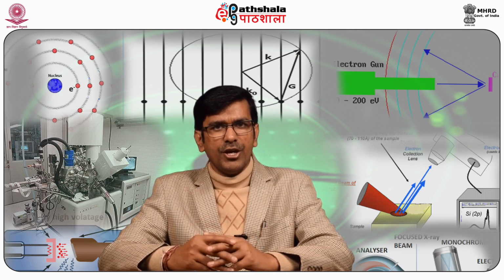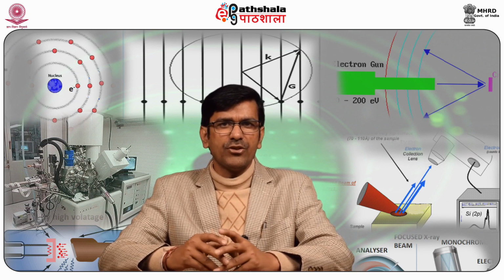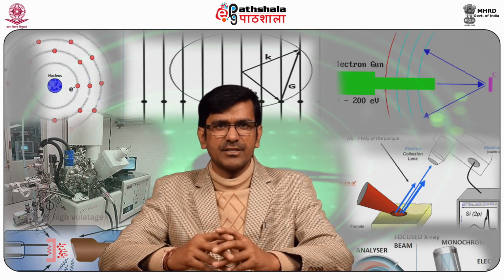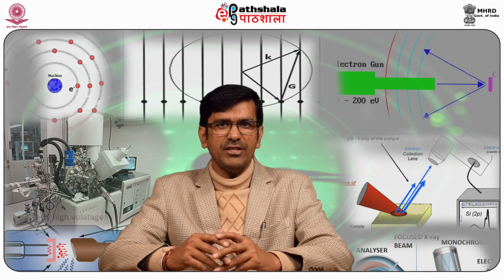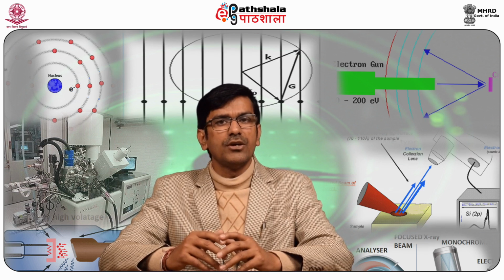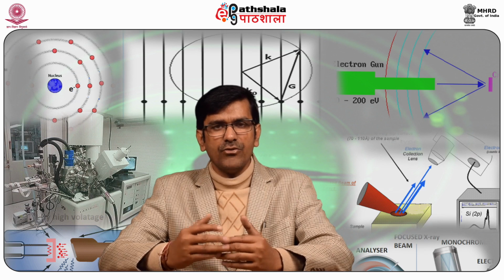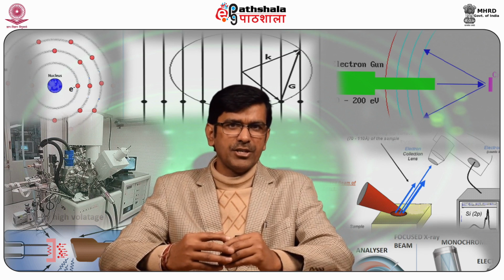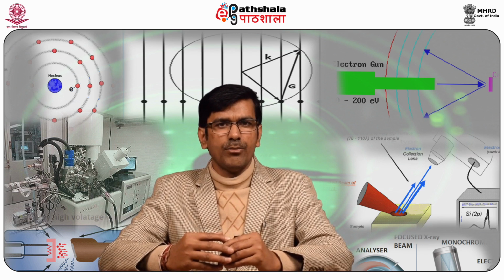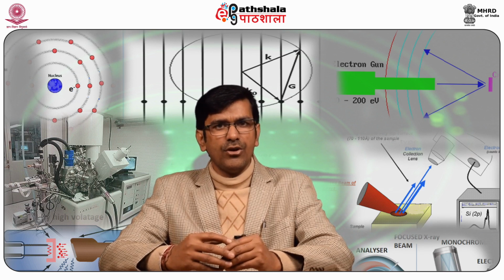One resolution improving technique that messes with the sensitivity is changing the width of the entrance and or the exit slits. For example, in an SDA, these slits define the range of trajectories of photoelectrons that enter or exit the analyzer. Decreasing the width will certainly cause the resolution to go up, but the smaller slit size will decrease the number of photoelectrons allowed in and out of the analyzer, therefore lowering the sensitivity.